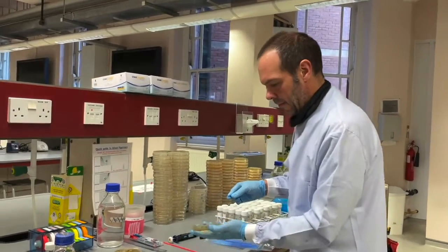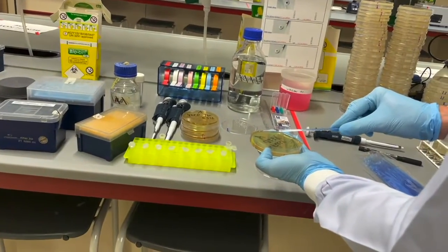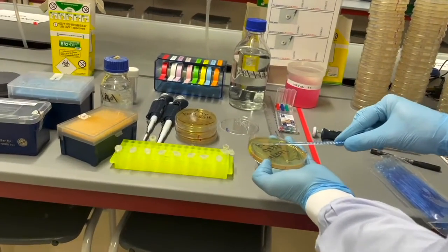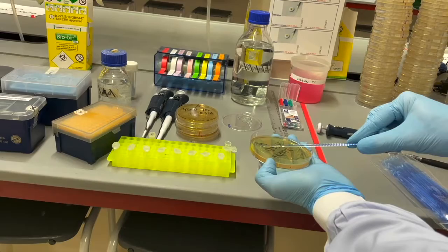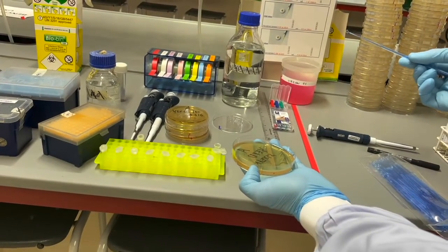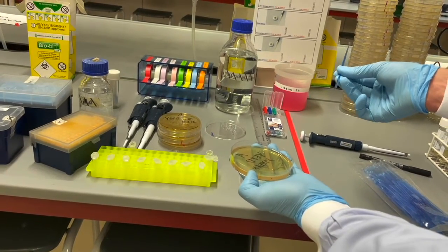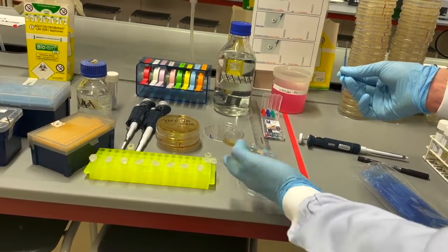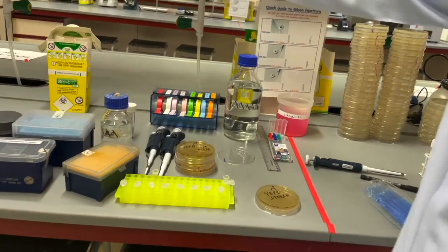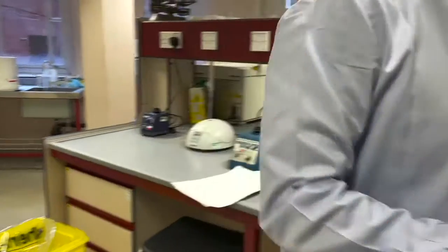So first of all, on the surface of the plate, I'm dividing the plate mentally into quarters, and I'm going to make sure I stick to the quarters. I'm going to fill a quarter with a streak like that. So there'll be more cells at the top of that streak than at the bottom. All right, I'm going to put that down, throw this in here, and get another one.